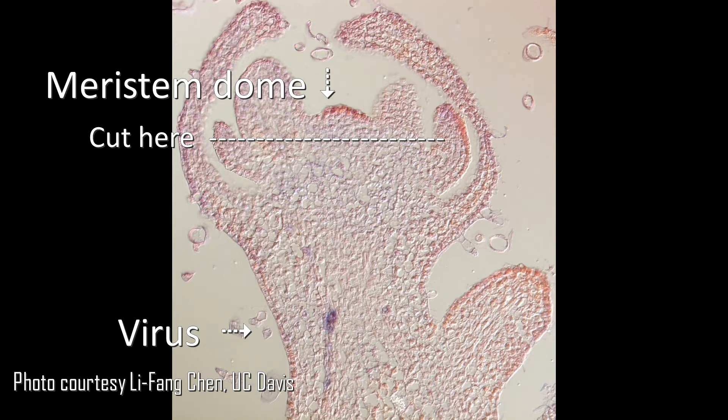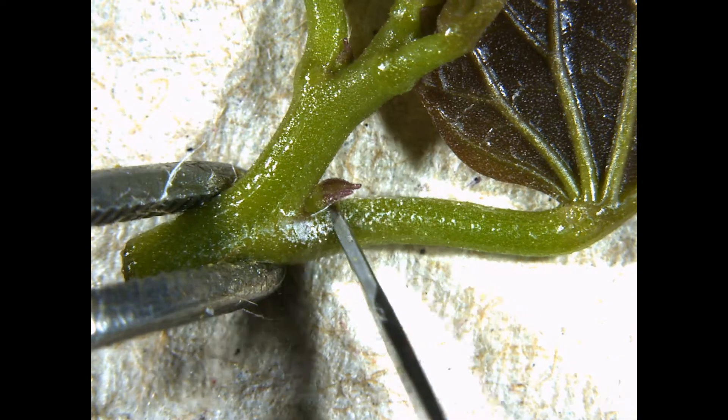Of course with different viruses, especially those that are not restricted to the phloem, it's a little more difficult to escape infection, so you always need to test the plants for viruses after treatment.